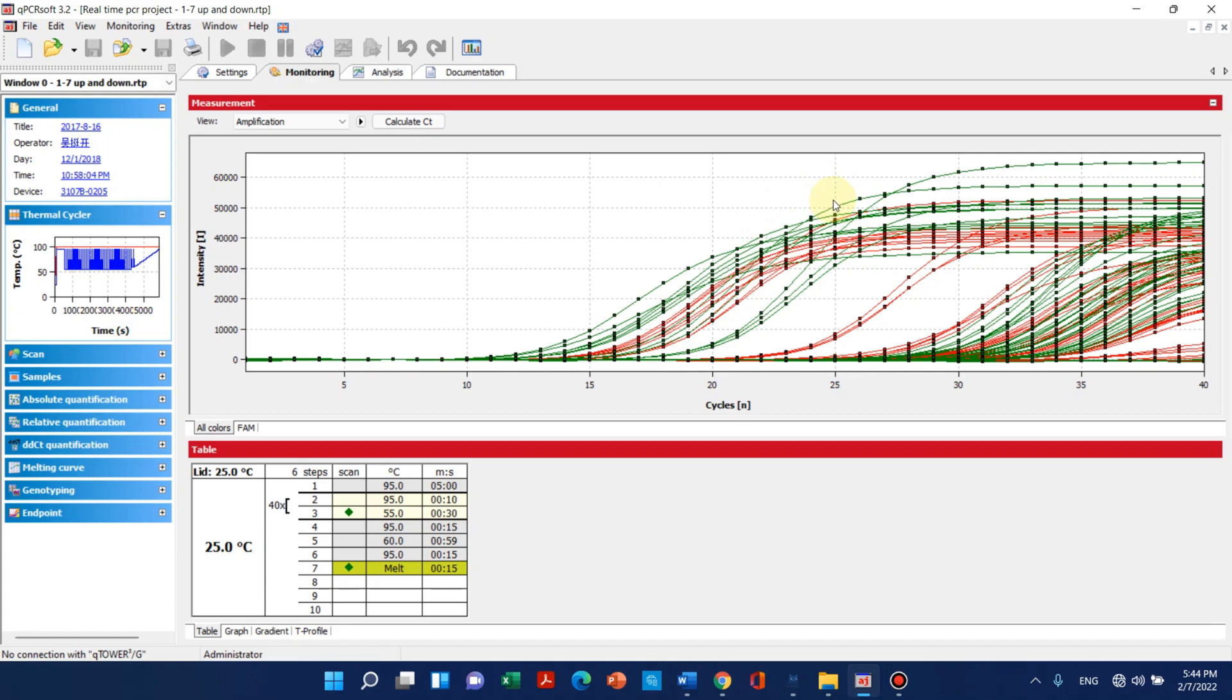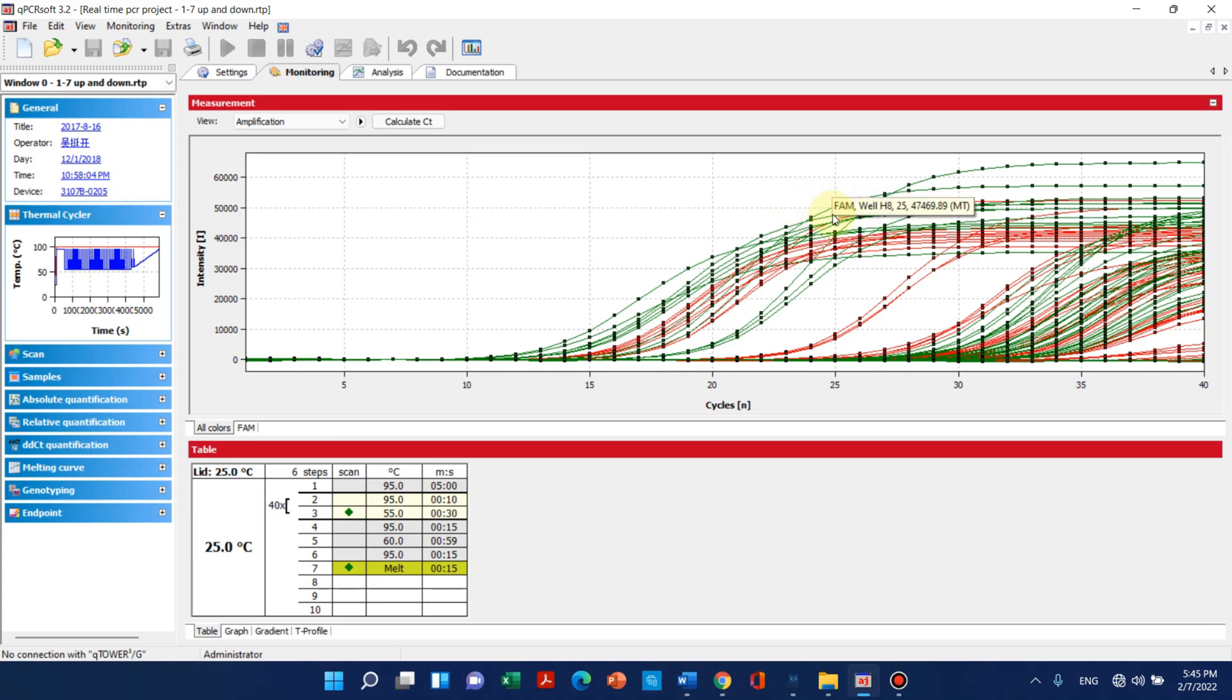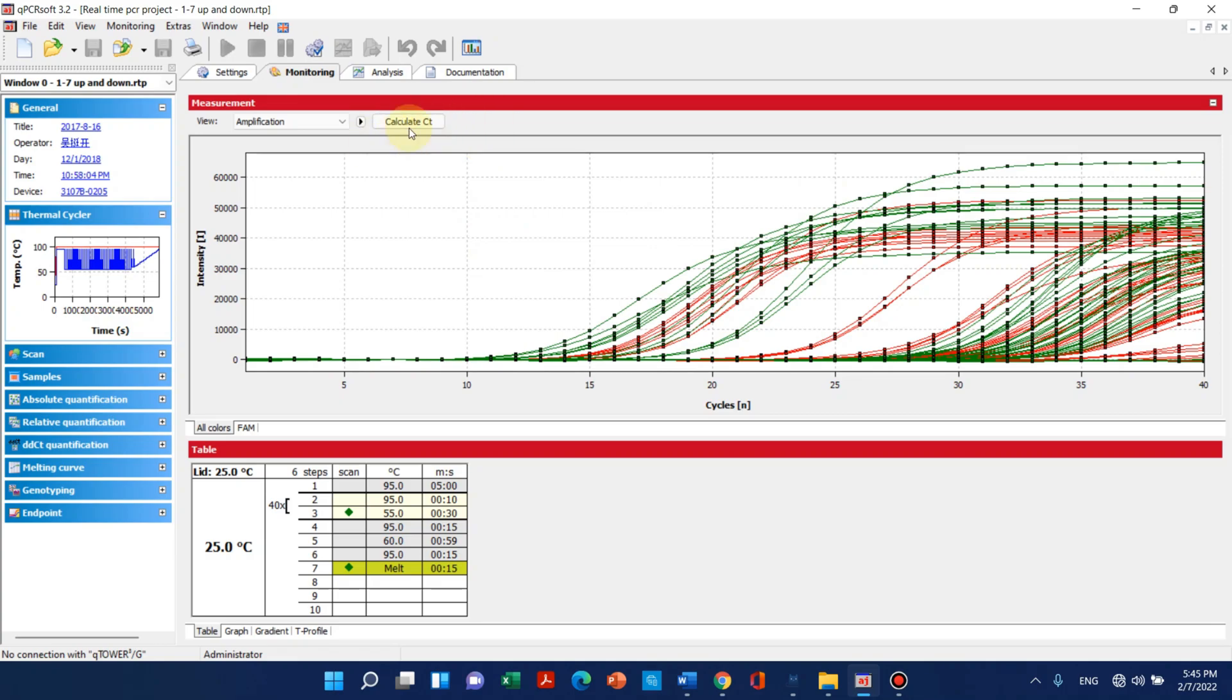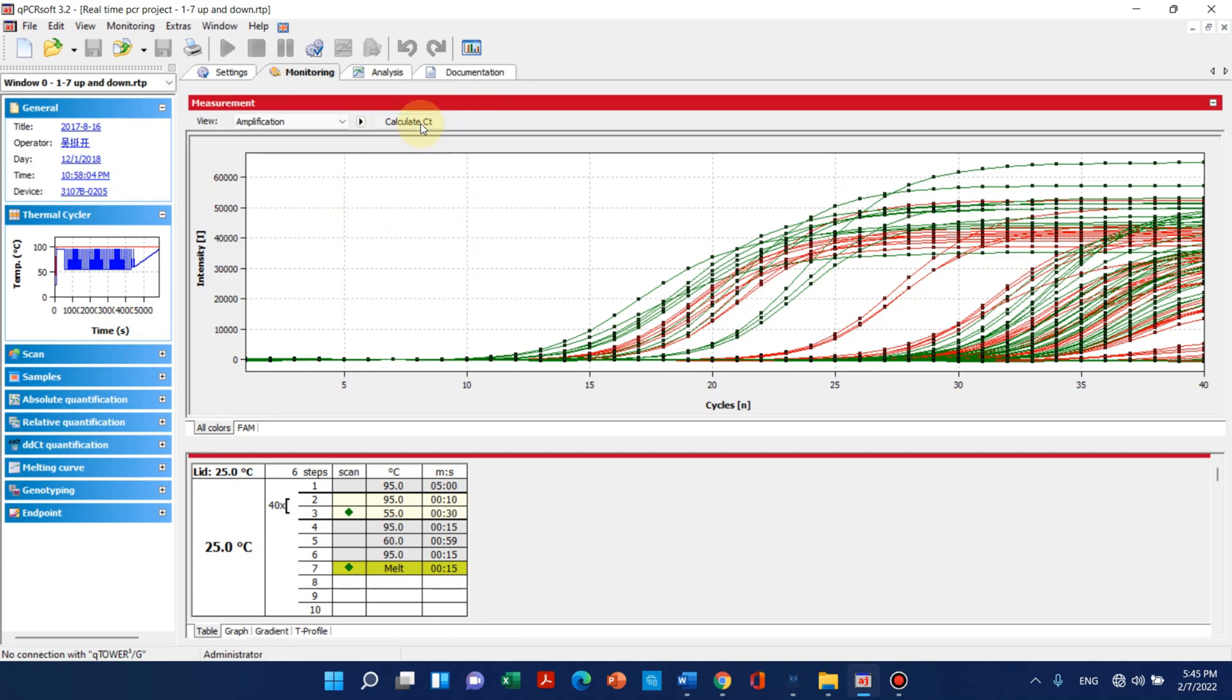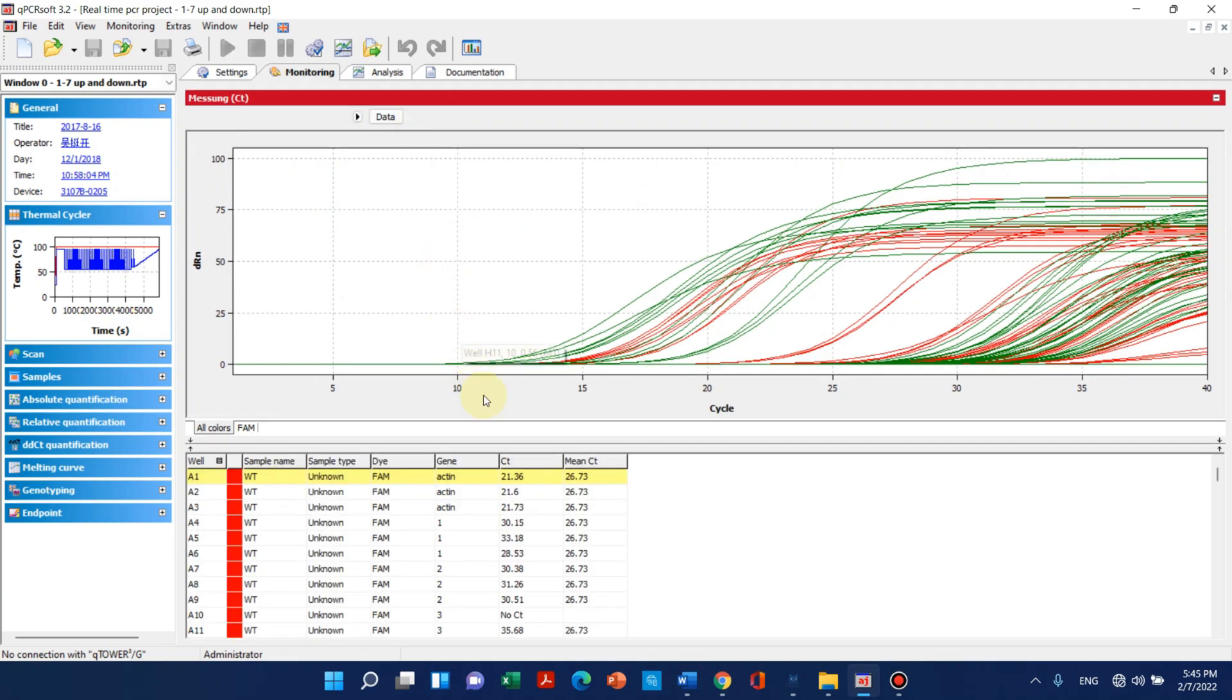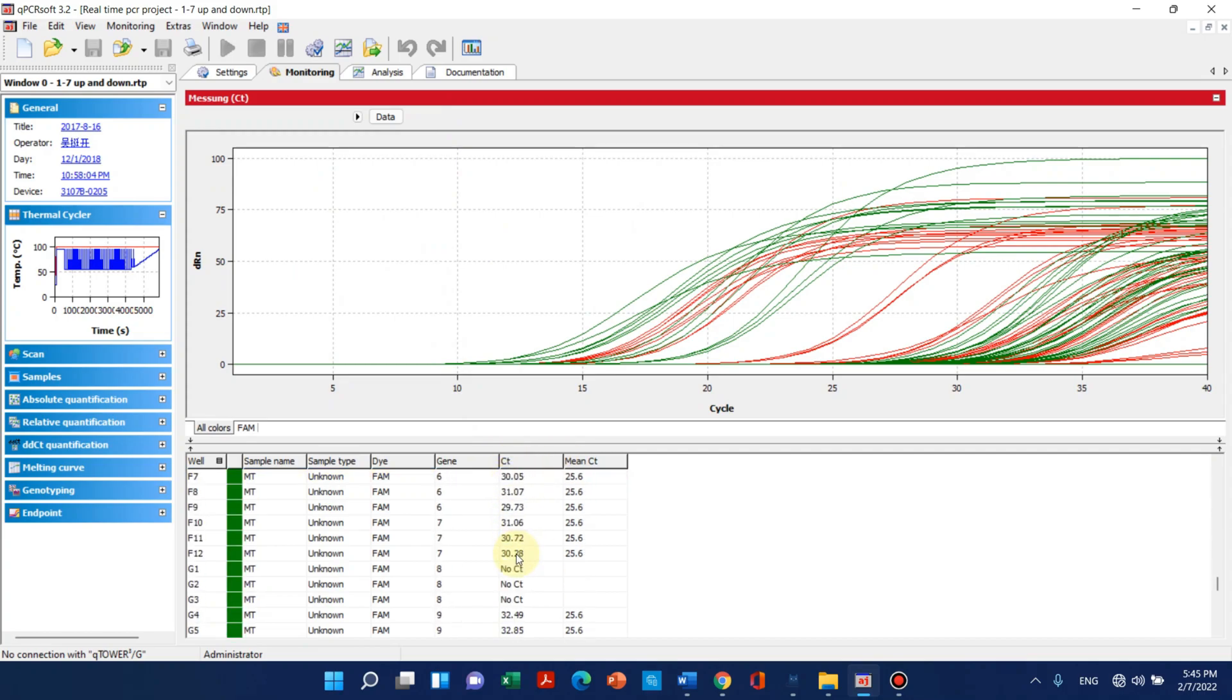We can also calculate CT values of all our samples. We just need to click on Calculate CT. We can see that all the CT values have been calculated. We can just go to Export and export these CT values for all of our samples and can use for later analysis.